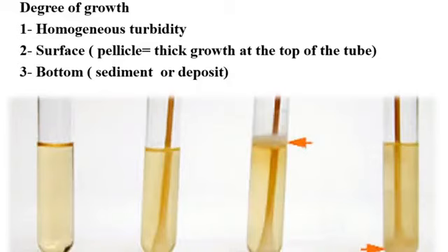In the last tube, the growth deposits in the bottom of the tube, sediment in the bottom of this tube. The bacterial growth is at the bottom of this tube.